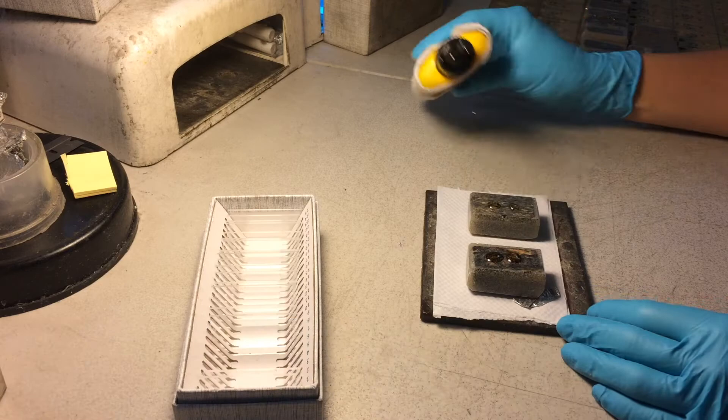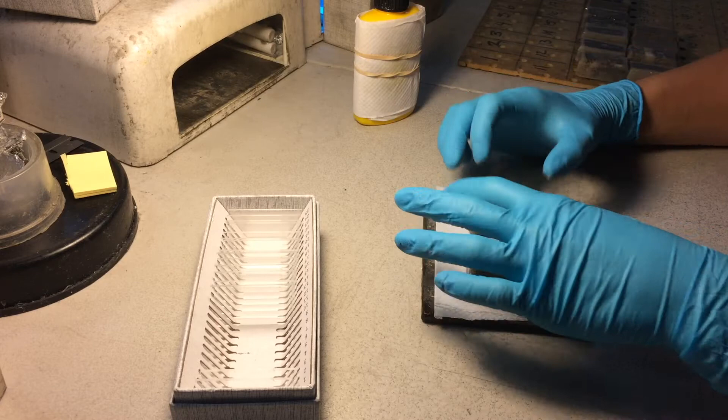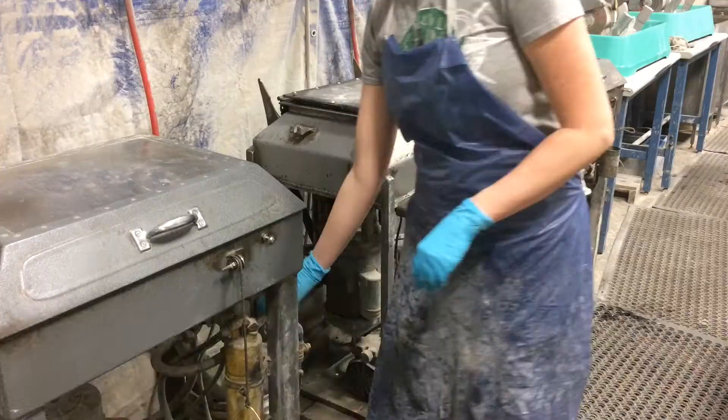During mounting, the glass slide is attached to the prepared billet. A few drops of adhesive are applied to the prepared surface and then the glass slide is put into place. Trapped air bubbles are encouraged to disperse by surface tension and light pressure. Then the sandwich is placed under ultraviolet light to cure the adhesive, and a few moments later the glass is securely attached to the sample.